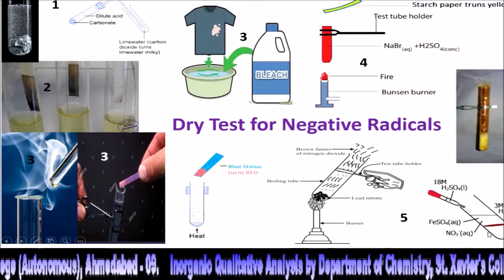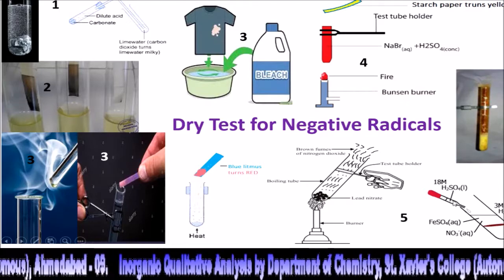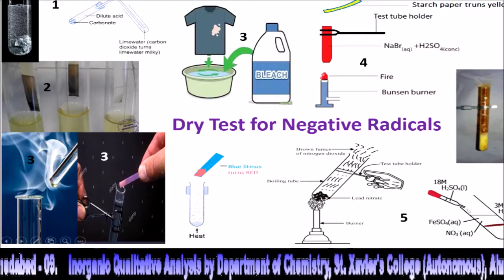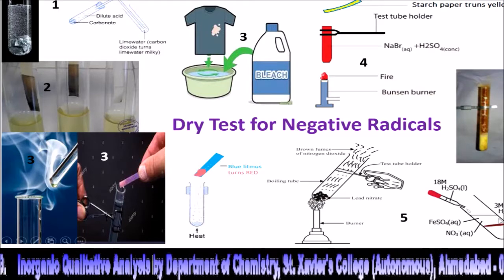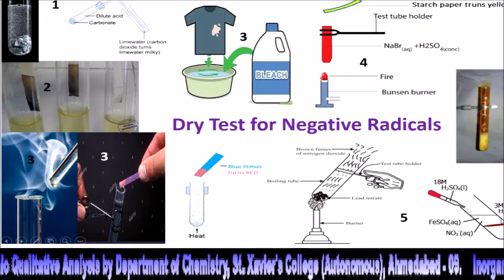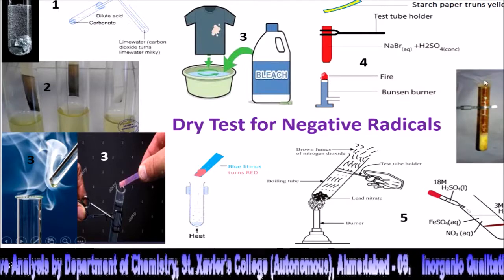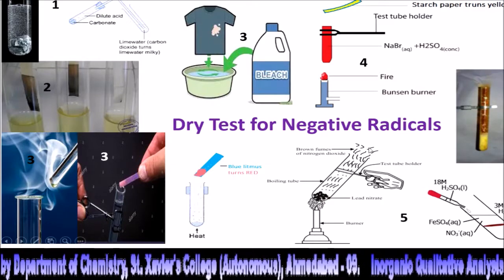You need to add H2SO4, FeSO4 and your compound, and H2SO4 has more density, so it will settle down at the bottom, and when it touches the solution of compound and FeSO4, it is going to form a brownish ring of NO. On the basis of that, you can identify that the brown gas evolved from this test tube would be from nitrate.